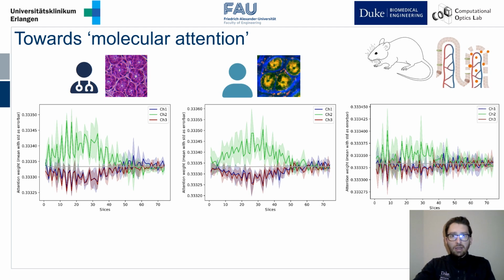I show you the 2 binary problems first, where you can see that the model picks the green channels, the NADH, to be more important to derive that prediction. And that is very plausible because those show the epithelial cells. And the most apparent, the strongest change really happens in the destruction of epithelial cells during these models. So that's a plausible sanity check for us.